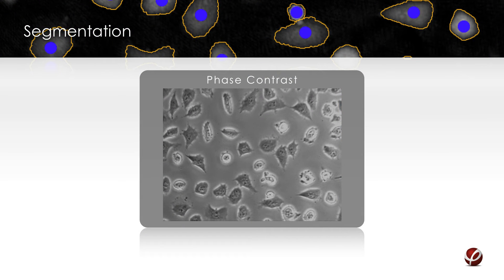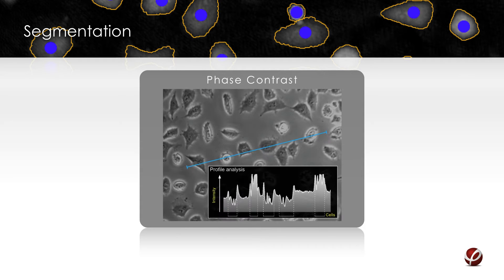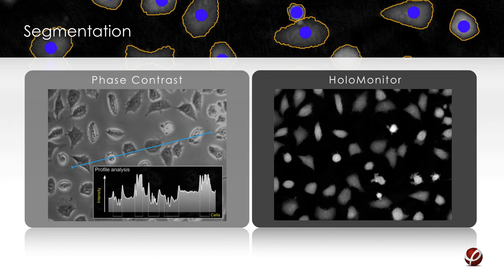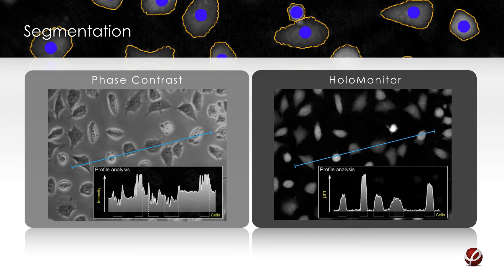The foundation of quantitative analysis is the ability to identify discrete events for quantification. In the line profile of the traditional phase contrast image, the background value cannot be accurately determined and a characteristic bright halo around the edge of the cells is present. This type of image does not lend itself for reliable segmentation. In contrast, holographic images can be quantified as they reflect the optical thickness of the cell and optical density variations in the specimen. Additionally, holographic images have a background level of zero and the intensity of the events measured as positive values.